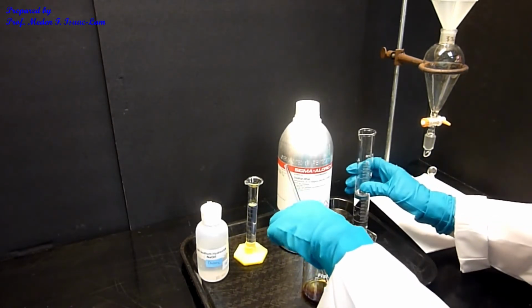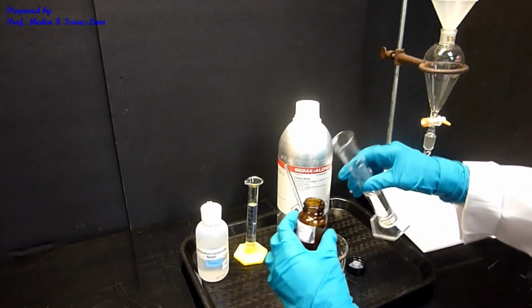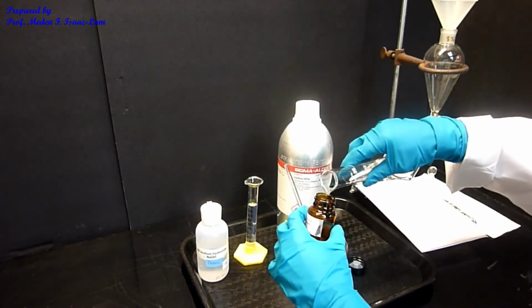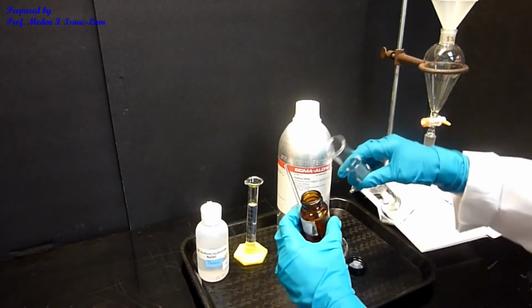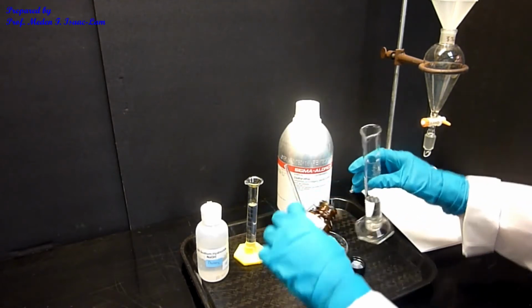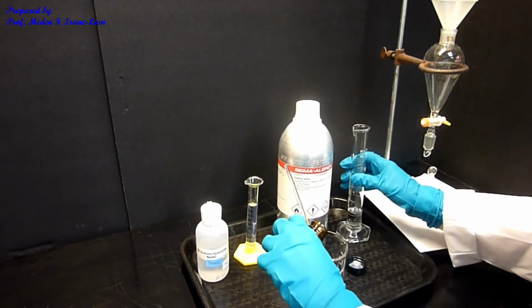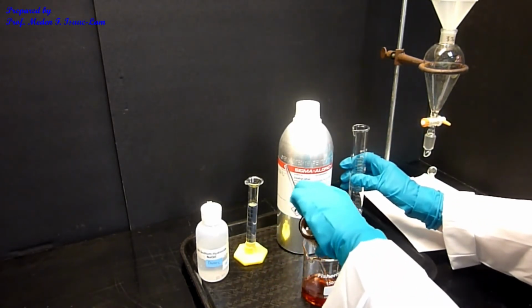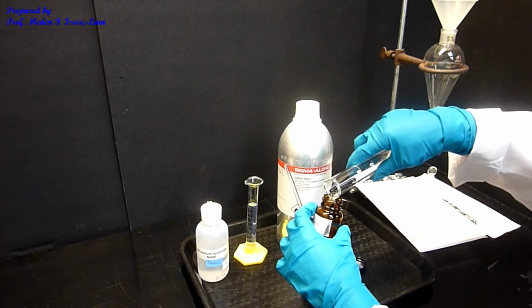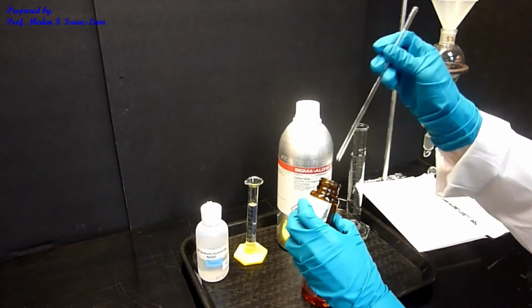I actually rinse out the mouth of the jar, and then I'm going to rinse out everything to make sure that I got out all the content of the jar. The ether is very volatile, and we typically use the hood, the bench hood, when you're doing the experiment.